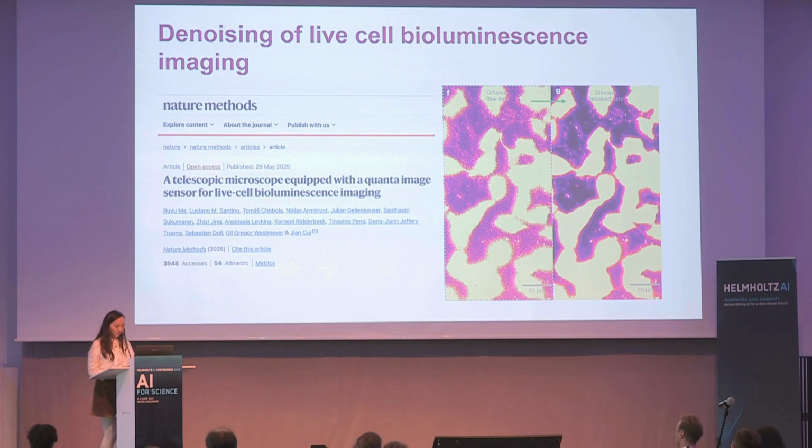Denoising is actually also used in microscope imaging. This is our joint publication with Jian, a very recent one. Jian has this very cool imaging sensor for bioluminescence imaging. Basically, you don't need fluorescence, and they have basically zero phototoxicity. Then after denoising, you can see in the background this cell-to-cell communication pathway much better.